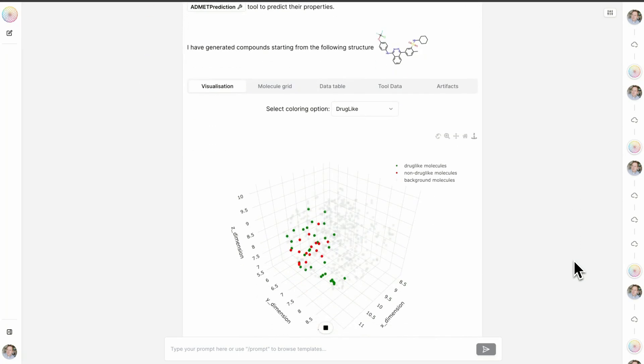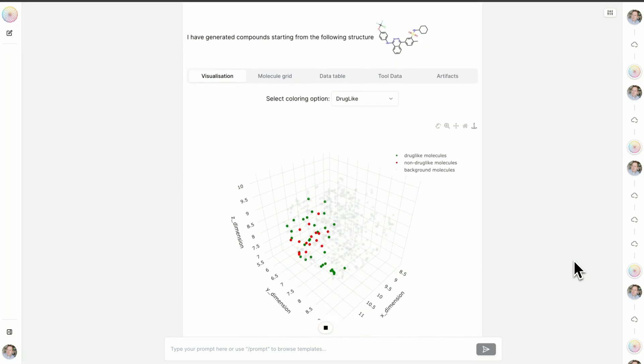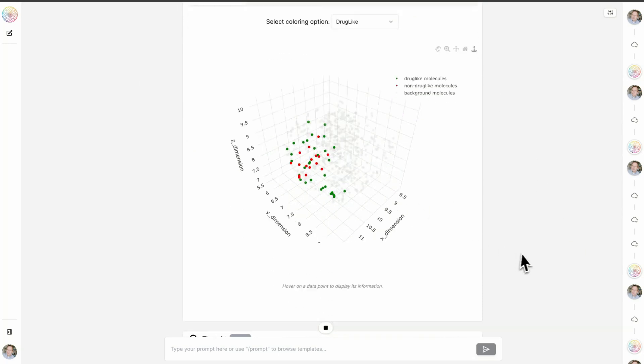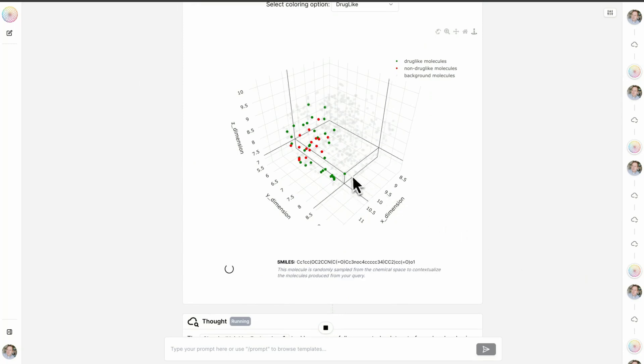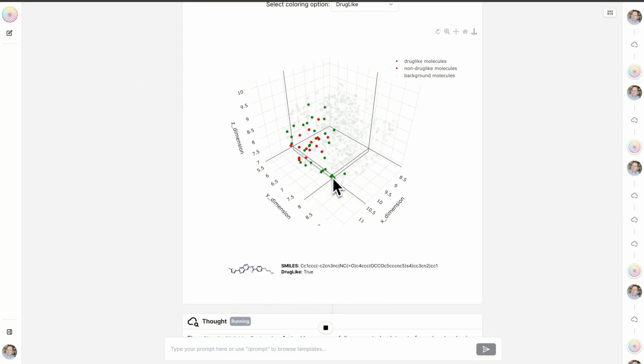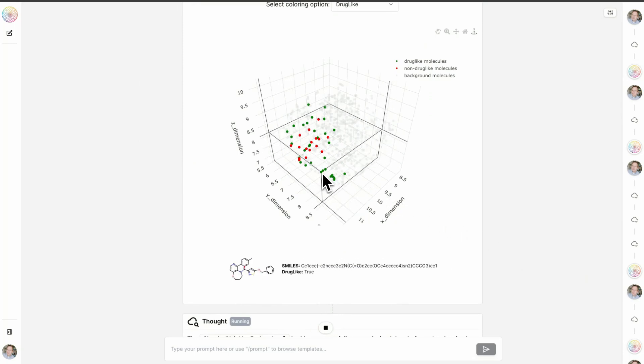Perfect. We have generated 50 molecules here based on this initial structure, and we can actually mouse over and begin to see what some of these potential drug-like molecules actually look like.